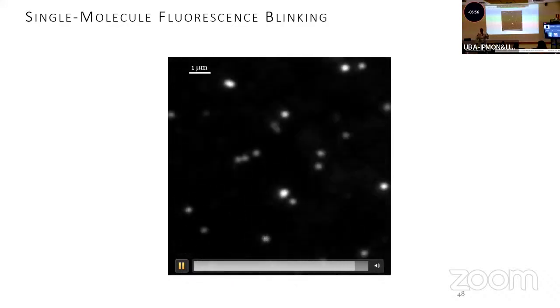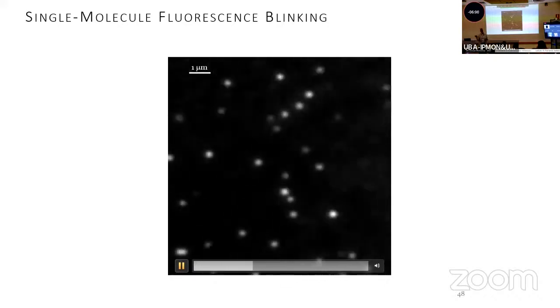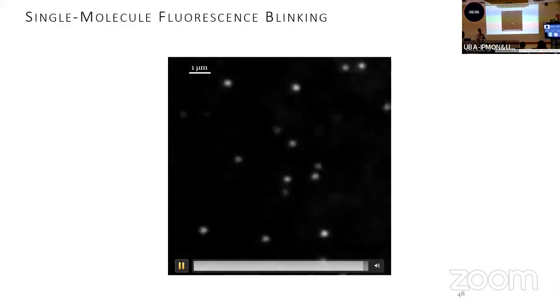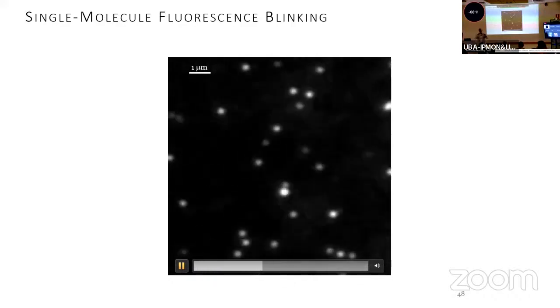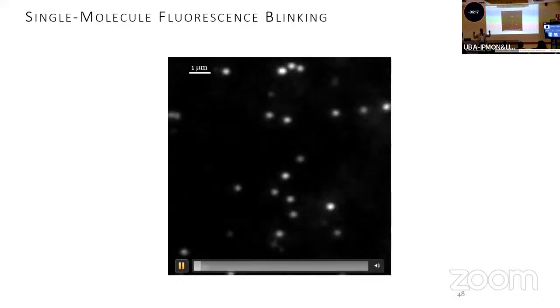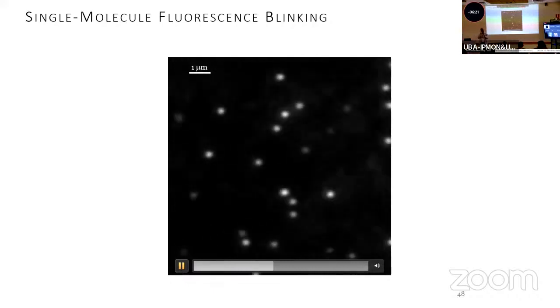Another criteria is the size. Out of focus molecules are usually discarded during this post-processing, either because the signals are too dim, or the signals are too broad. So at the end of the day, you collect an image that is a projection of all those 500 to 600 nanometers. That is if you don't do anything to achieve optical sectioning.